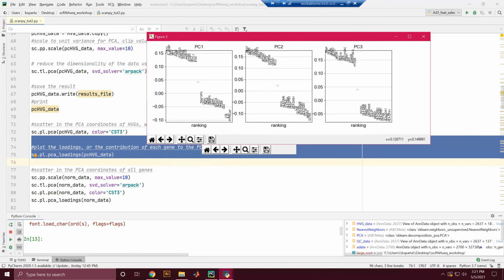So here's the highest contributor down to the least. And if you zoom in on this graph, you'll notice that the squiggles are gene names. So you can see CST3 and this whole set of genes, this combination of these set of genes are contributing highly to the first principal component, whereas principal component 2 is determined more by this different set of genes and so on.